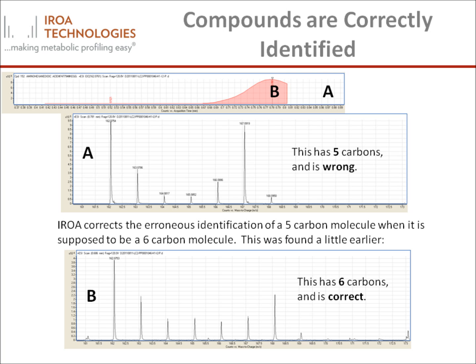In summary, the IROA ClusterFinder software automatically removes all artifacts and accurately identifies and quantitates all biological extracted compounds to report differences between control and experimental samples, which can then be used as potential biomarkers.